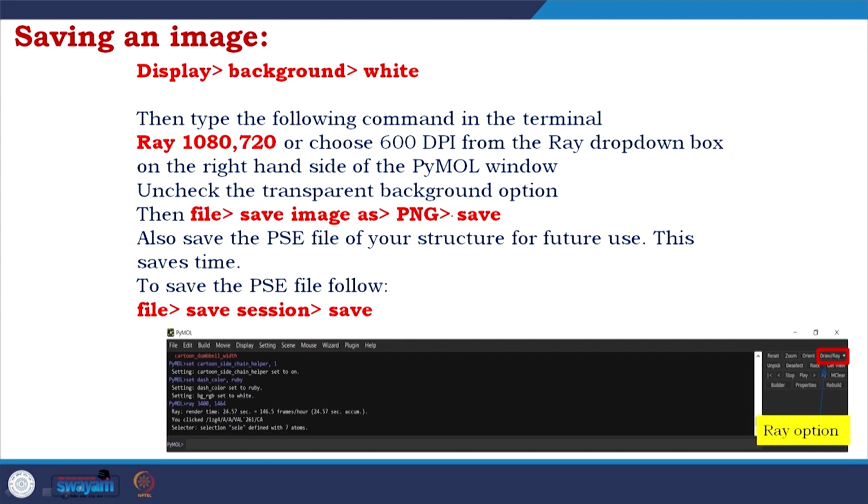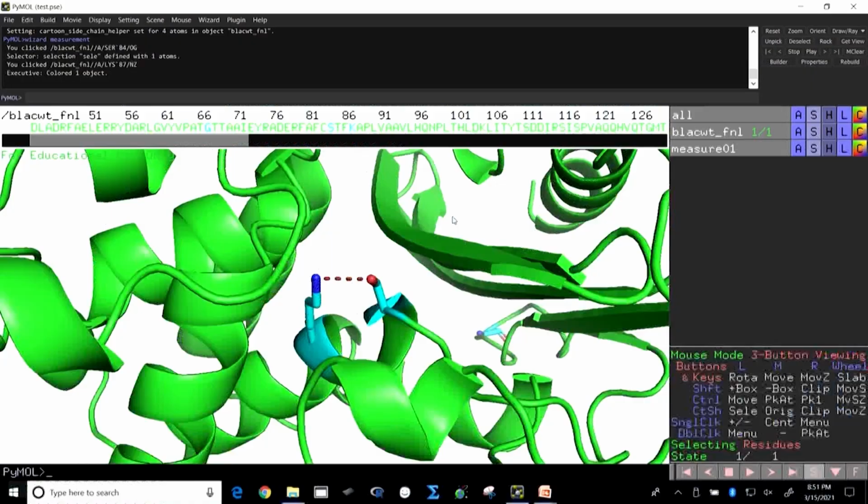If you remember again, in the POV-Ray, in the Raster3D, those are the technologies which come from them, and now it is integrated to any visualization platforms. So, with that I would again switch and show you the condition which we have in the PyMOL.